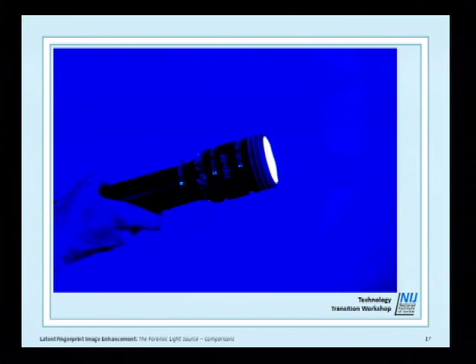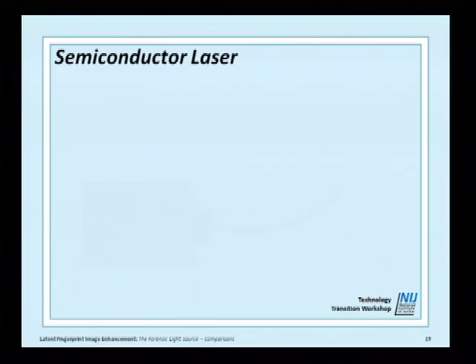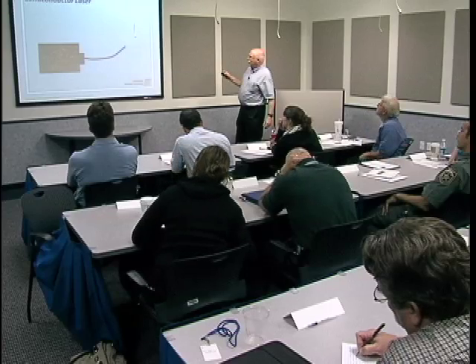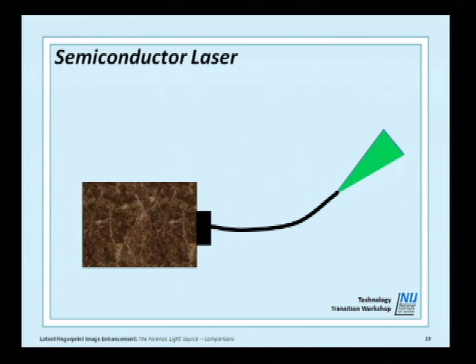So we have a whole array of choices in the LED area, and they have some very definite advantages. The semiconductor laser is again similar technology, and the wavelength, as I said before, can be engineered.